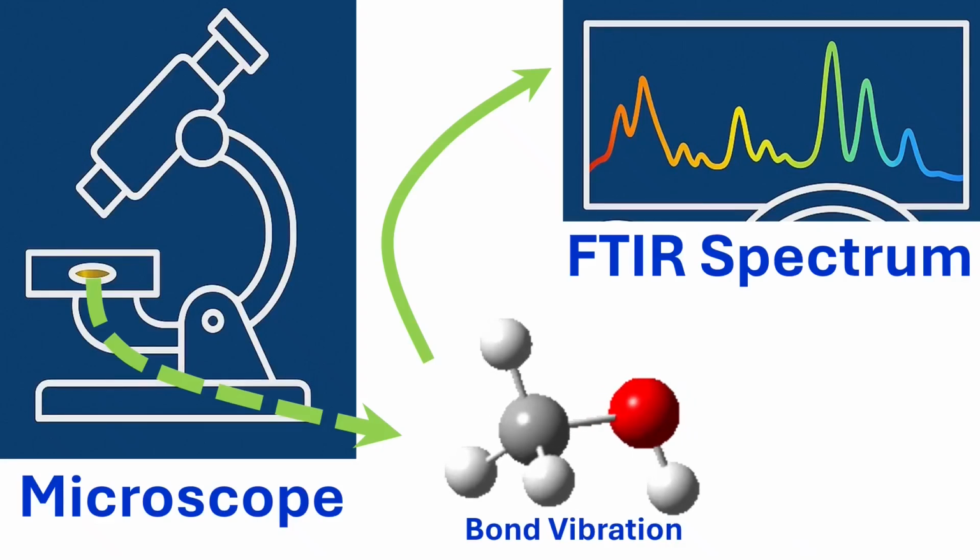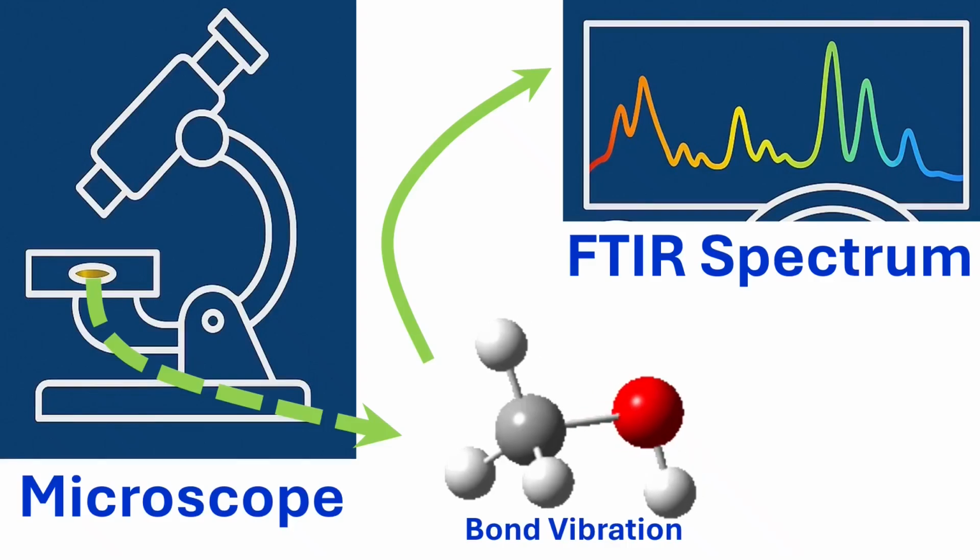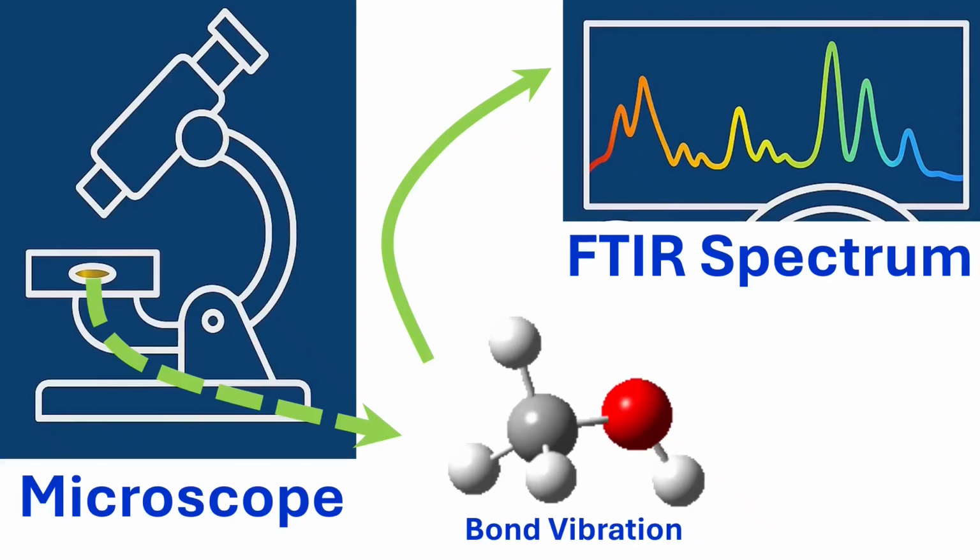It combines infrared spectroscopy and microscopy to provide chemical information about a microscopic location of a sample, in relation to its composition and structure. It can identify unknown materials, chemical reactions, and even the distribution or mapping of components in a complex sample. It can be applied to pharmaceuticals, polymers, biological materials, and nano-materials.